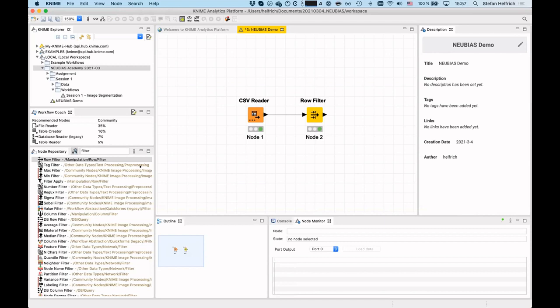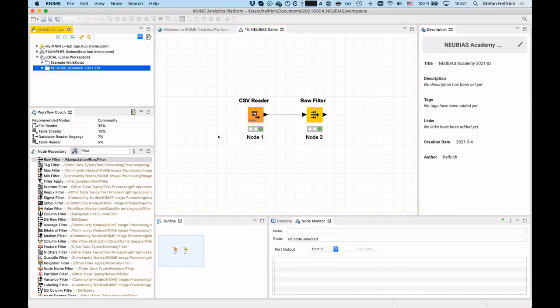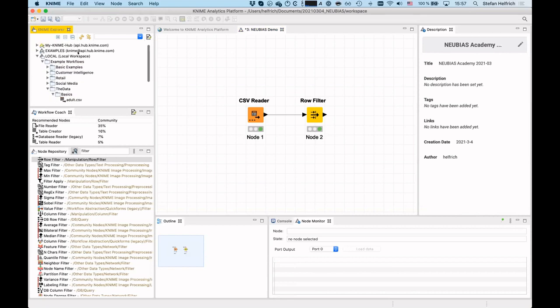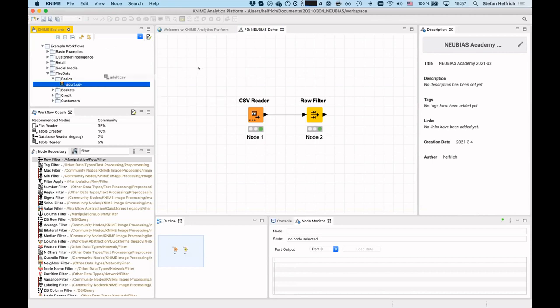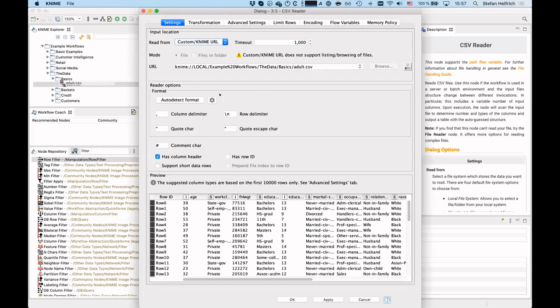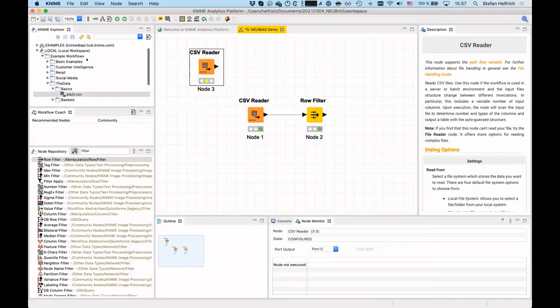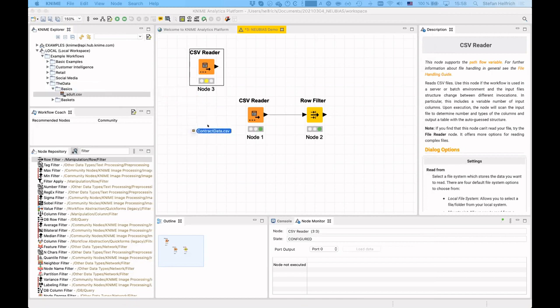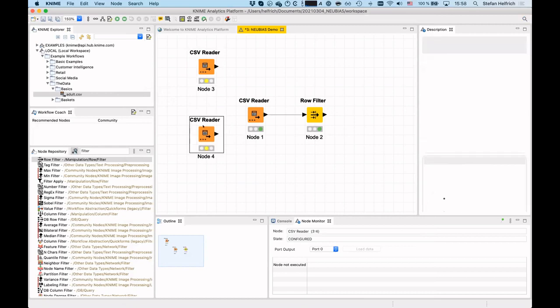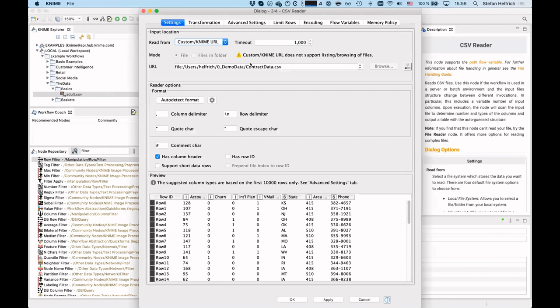There are keyboard shortcuts and other small shortcuts to speed things up. For instance, instead of manually creating a CSV Reader node, you can drag a CSV file from the KNIME Explorer (or even from your file system's Finder/Explorer) directly onto the workflow canvas — it automatically creates a correctly configured CSV Reader node pointing to that file. This makes getting started a bit easier.